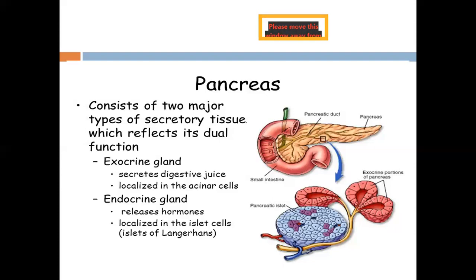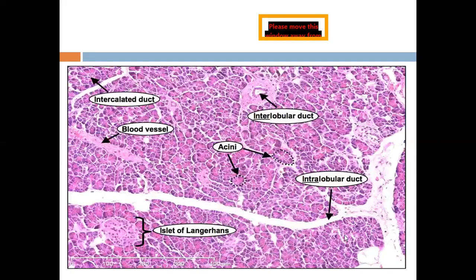The pancreas has both exocrine and endocrine secretion. The endocrine component of the pancreas is represented by the islets of Langerhans, which are diffused and separated among the exocrine secretory acini. Now we're going to go part by part.